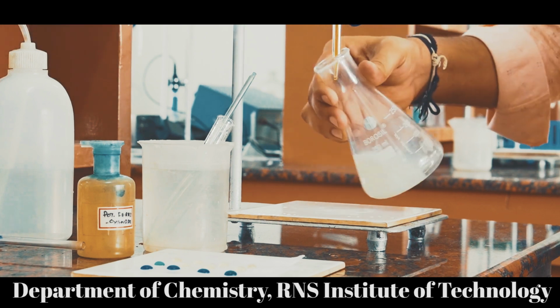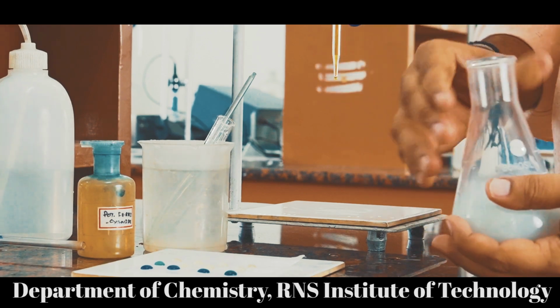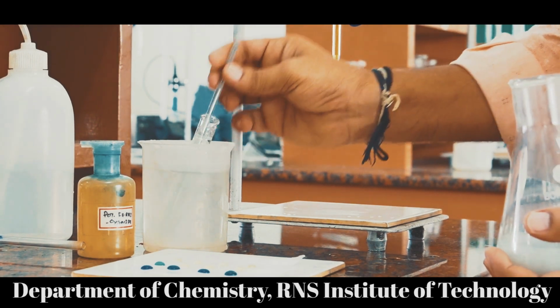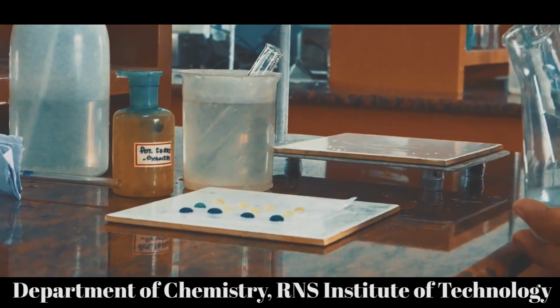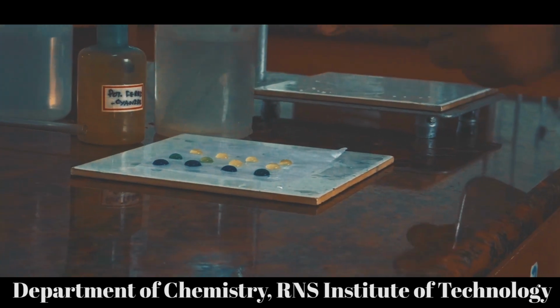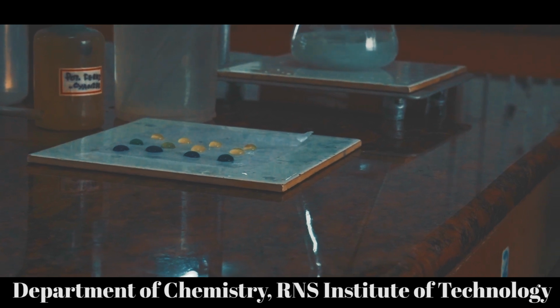Stop. So now we may have reached the end point. That will be indicated by no change in the color of the indicator. If the indicator droplet fails to turn blue, then that is the indication of the end point. See here, a little bit of color is changing again. So you can go 1 more ml, no problem.